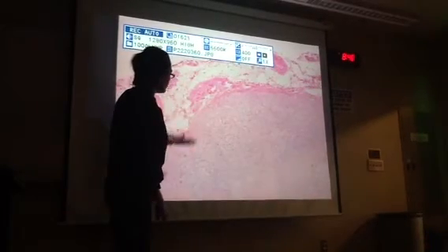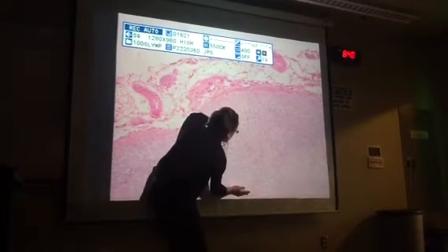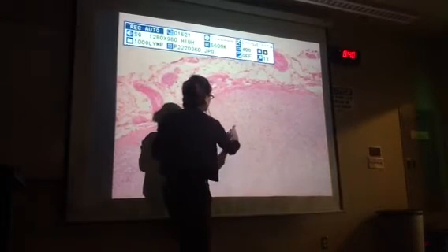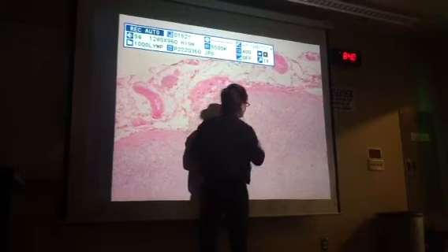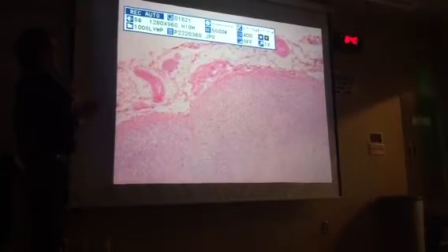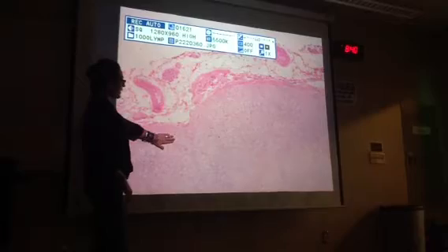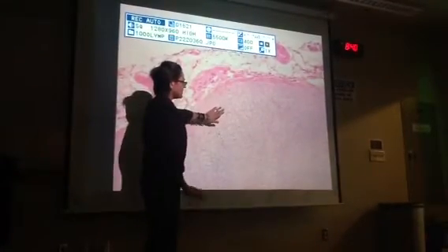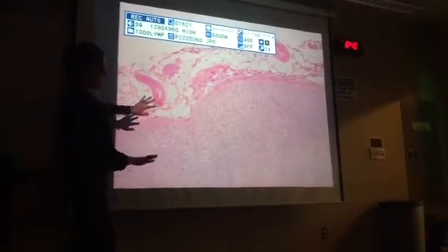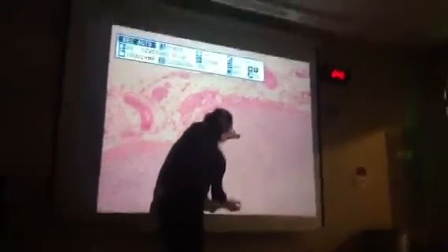And then you go into the next layer, going from about here down to about here. That's your zona fasciculata, and these cells are running like this. It's definitely going to be your biggest layer. Again, I use the capsule and the medulla as a point of reference. The cells right below the capsule are glomerulosa. The cells right above or on either side of the medulla are reticularis, which we can't see here. And then this big group of cells would be fasciculata.